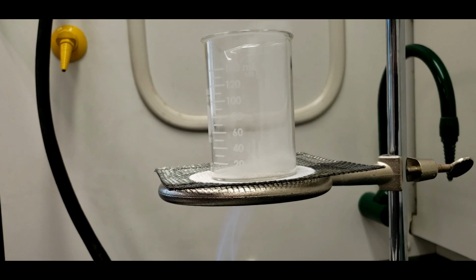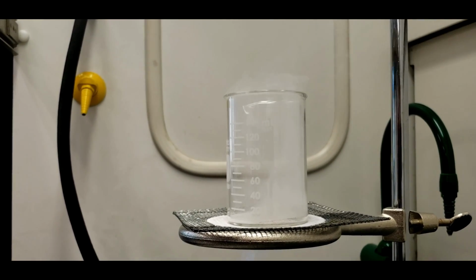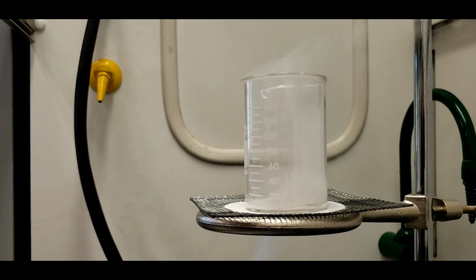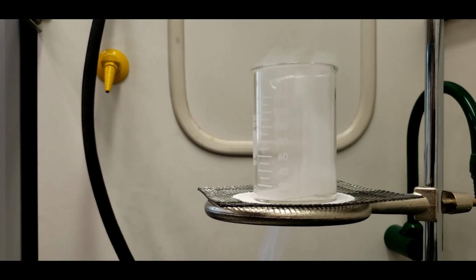Alright, it's been heating for about 2 minutes. You can see that white smoke is the ammonium chloride changing from solid directly to gas. The fume hood is drawing that off. So we can go back a little bit here and see. And we're going to let that go for about 10 minutes and see how much of it will go in that time. And then we're going to weigh it after that.